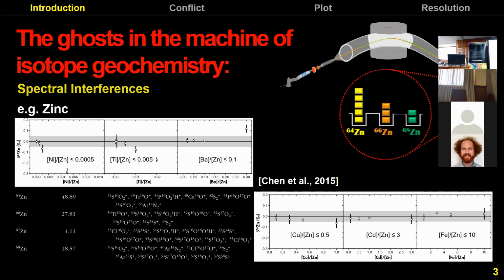And one reason that it's interesting to talk about what's actually going on with the sample prep and all of that is that it's not so easy peasy as it seems. There's actually a fair bit that has to go into the samples before you can actually put them into the multi-collector. Basically you need to strip everything out except for the element that you care about.